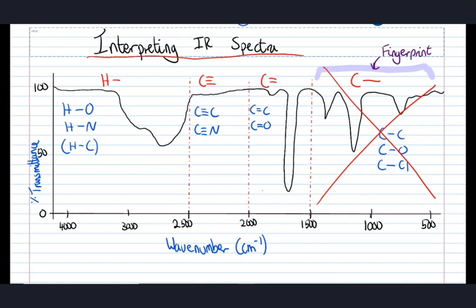Now, there's always plenty to talk about on an infrared spectra, so don't worry that I'm saying to you ignore the fingerprint region, ignore hydrogen single bond carbon. There's always going to be plenty to talk about as well. So let's have a look at this spectra.